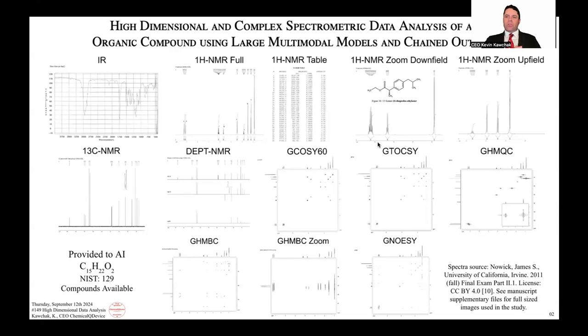When you're talking about high dimensional data, you're typically talking about having to pre-process this data on your own using principal component analysis, partial least squares, these types of methods. Now, when I asked the models themselves, 3.5 Sonnet and ChatGPT 4o, what would you use for this, they both responded similarly, like these methods like PCA and PLS. And then when I uploaded the data and asked them, 3.5 Sonnet wasn't as specific. It just said it would just do it, for this specific type of problem. And then ChatGPT 4o said something like it's a problem-specific dimensionality reduction.